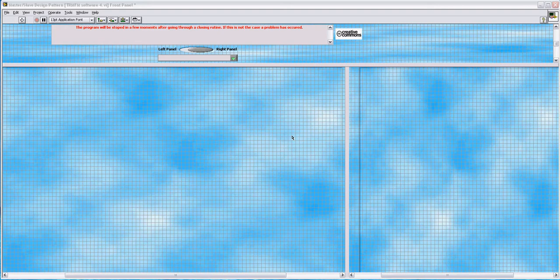So when you do an experiment, you are using some instruments, physical instruments, and for every instrument that you're using, there is an instrument driver, if that instrument is controlled by the computer, obviously. So this instrument driver is like the virtual equivalent of your instrument controlled by the computer. And building an application is basically gathering all these instrument drivers associated with these physical instruments together and configuring them individually. Okay, so let's see how we can do this.